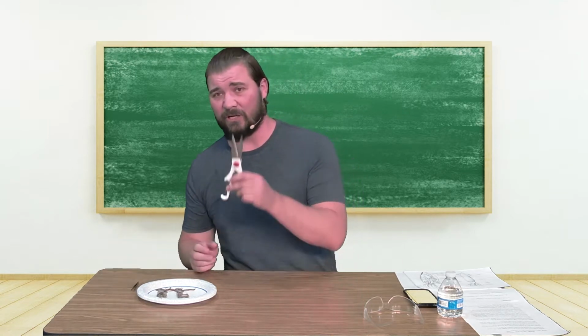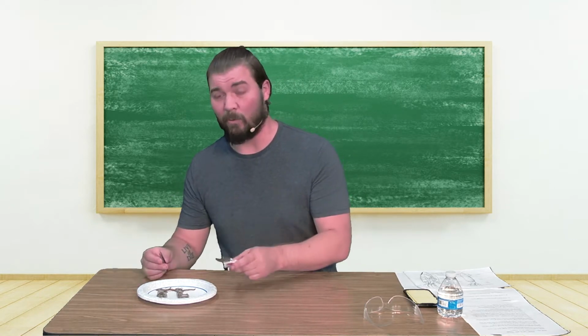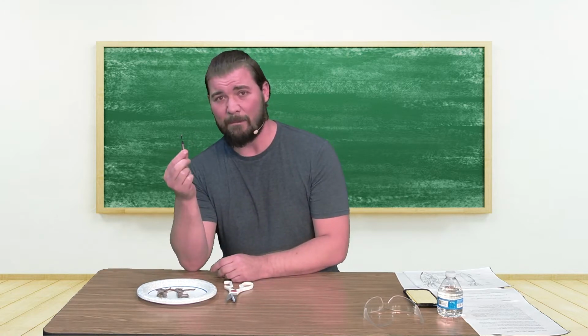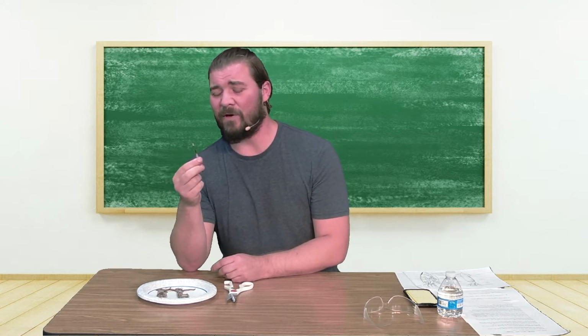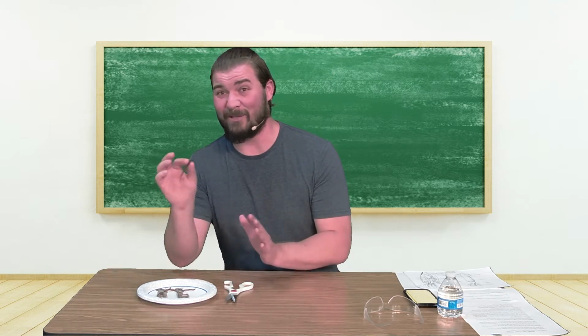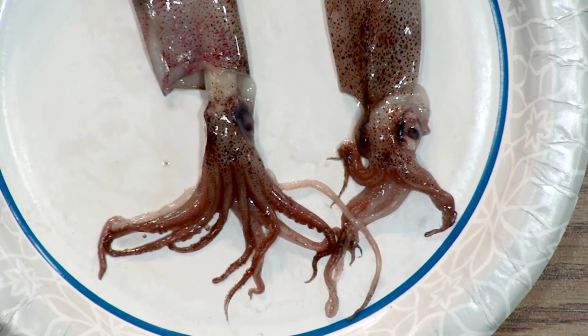So some tools you're going to need. I got me some scissors from my home kitchen, all right? I will wash them very well before I use them again. And I've got some tweezers. Metal tweezers I find work best. And so I pulled these out of the makeup drawer from my wife, and she'll probably find out and be pretty upset. But I promise I'll use some bleach right before I give it back to her and make sure there's no smell. So we're going to dive right in.